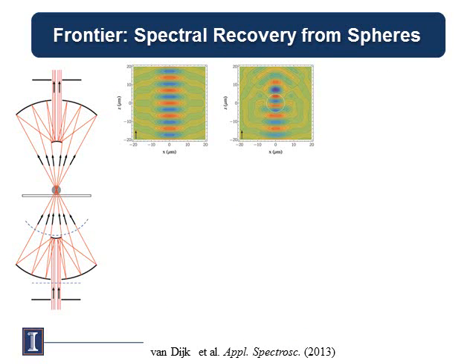The first one is something that is of fairly contemporary interest. What happens when you take your microscope and put a sphere in it? It's a simple thing. You take a polystyrene sphere. These are fairly consistent sizes. Everyone knows what they look like. And you put it in the microscope, and the data you record actually look nothing like polystyrene. So the electric field and the light intensity that is transmitted look like this, which is perhaps less interesting to this audience.